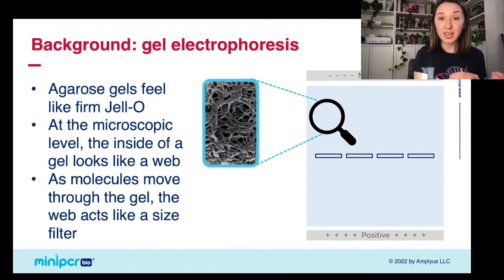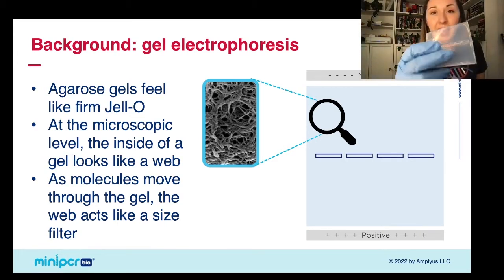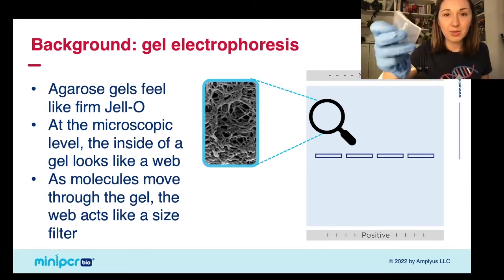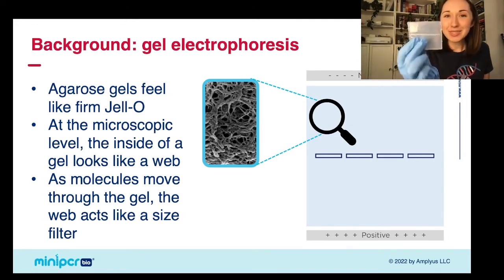Now, that gel that we're going to be talking about today that you saw me add the dyes into is made out of agarose. And I have an agarose gel here that I can sort of hold up to the camera and show you. I'm just going to put a glove back on. And so this right here is a pre-made agarose gel that I just made about an hour ago. And so you can see that it's kind of like a firm jello. It's a little bit squishy. It's a little bit cold. But it is really a lot like jello.